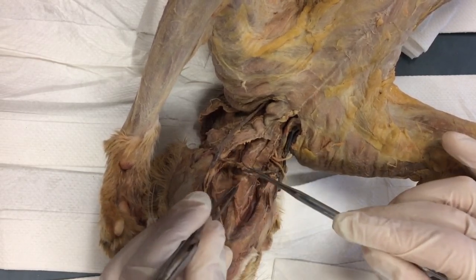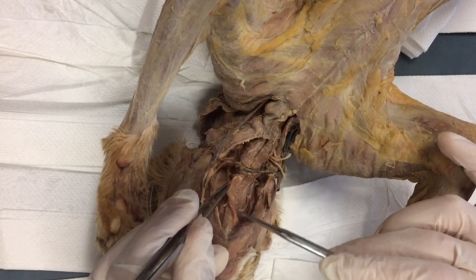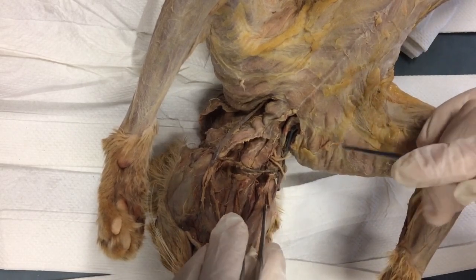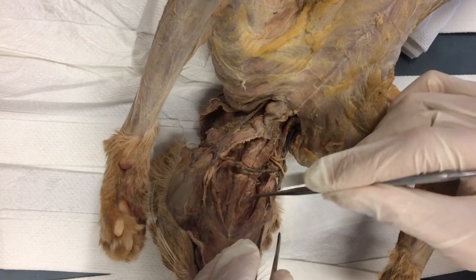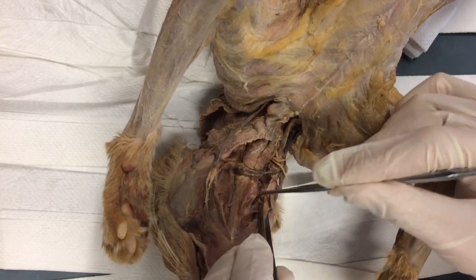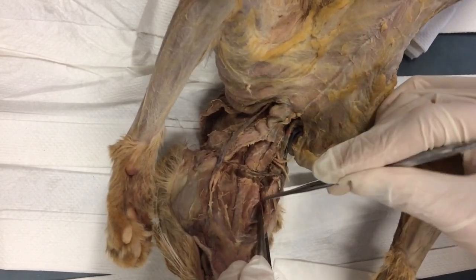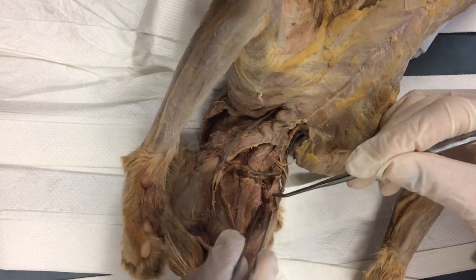Now you can see how that's really attached right there. I'm not going to be able to get that free. There's no way. So with this little piece right here, I'm just going to take the edge of my forceps, put it in there. Whoops, I can't get it. And then I'm just going to dissect this back underneath the cheek. Get this right under the mandible. Just keep pulling. This is your 1/3 piece.